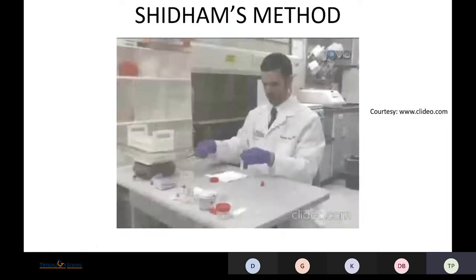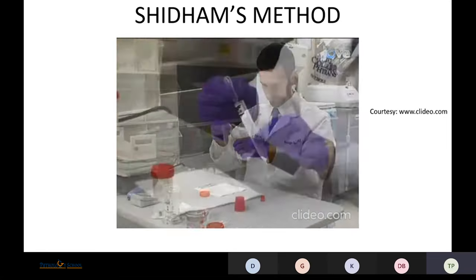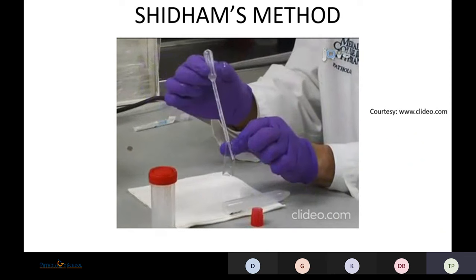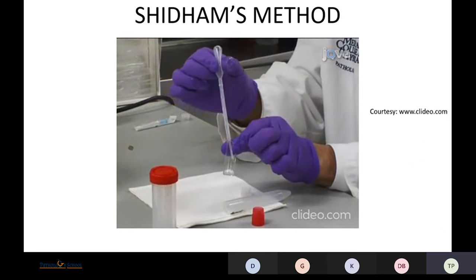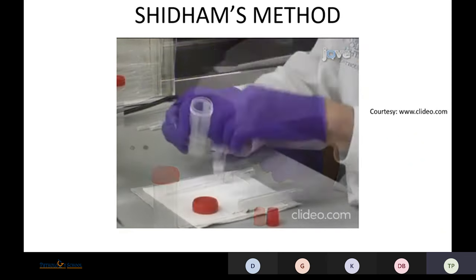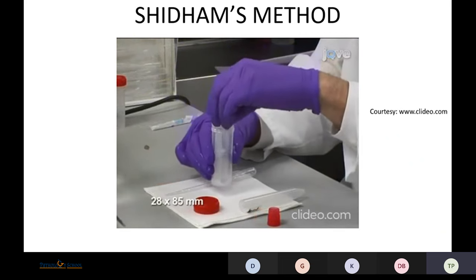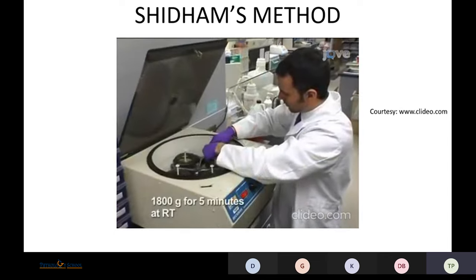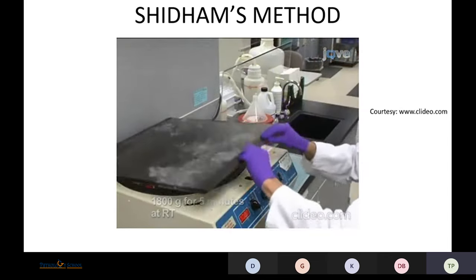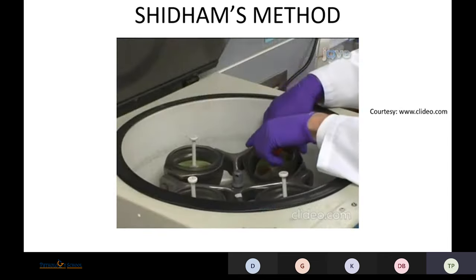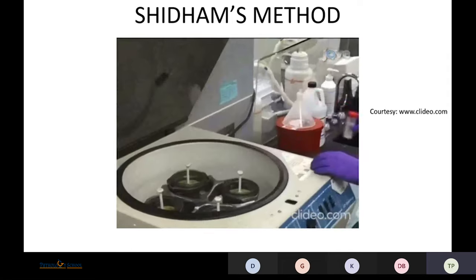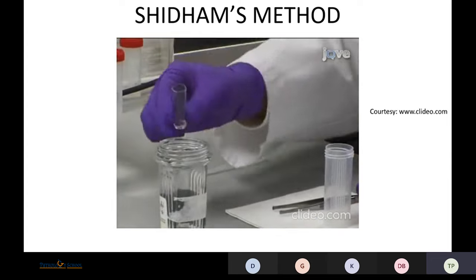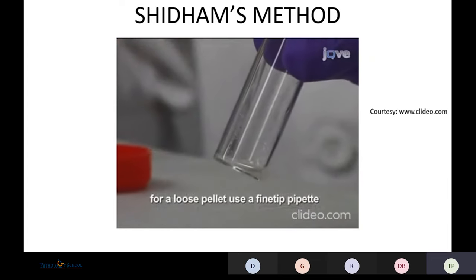To begin this procedure, transfer about 0.5 ml of a pre-spun concentrated specimen to a 45 mm long flat-bottom glass tube with a 15 mm diameter. Place the glass tube into a large flat-bottom plastic carrier tube and centrifuge at 1800 g for five minutes at room temperature. After centrifugation, remove the glass tube from the carrier tube and pour off the supernatant, taking care not to disturb the flat layer of cell sediment at the bottom.